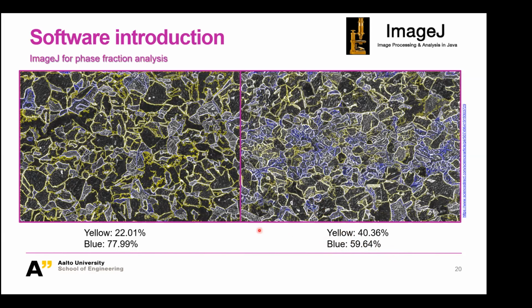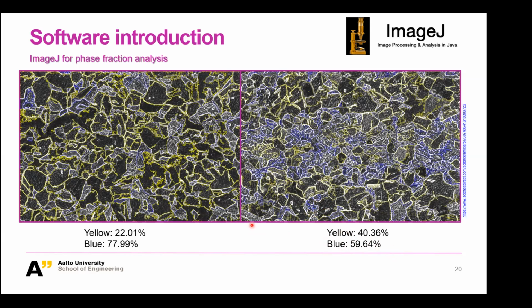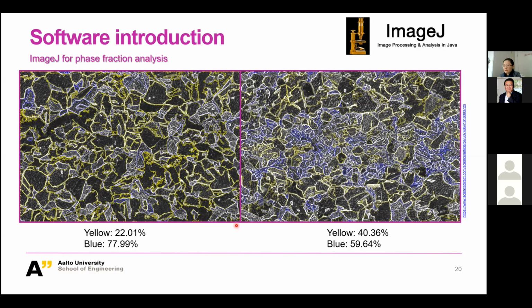That means the LOM or SEM observation, or even much smaller observation like TEM, they only have a limited measurement area. If you want to obtain a global overview microstructure description of your material, you need to repeat your measurement within a large sample surface area at different positions.